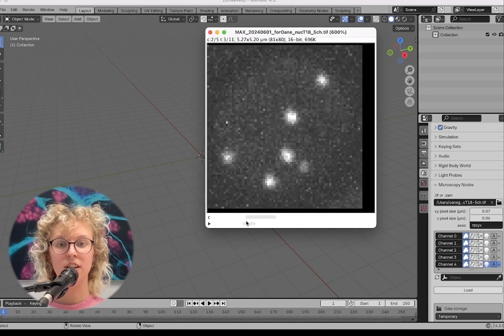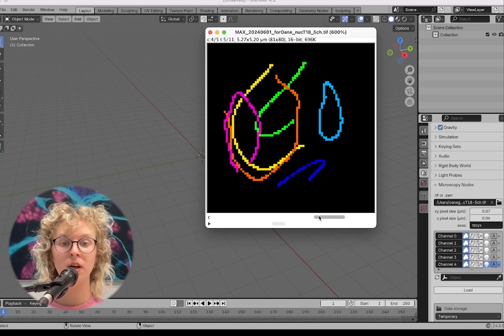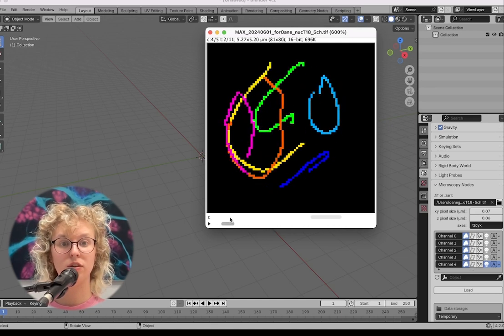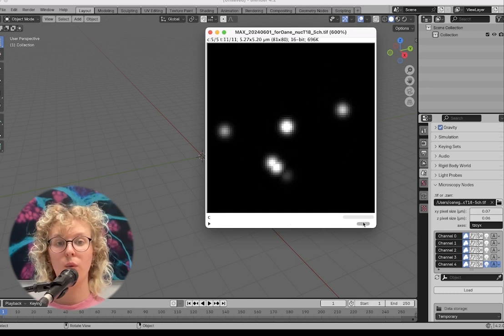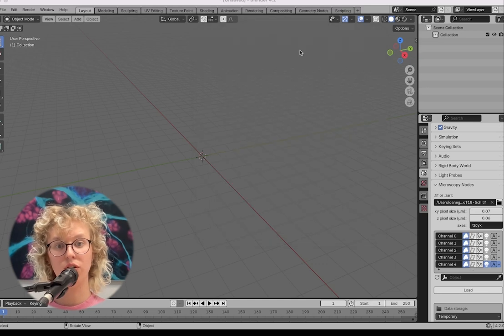And then in the second channel, we have the spots where the crossovers are. Then in the third channel, we get the localized spots of the crossovers per chromosome. This is analyzed with SpotMax. Then we have the chromosomes, so the separate traces of the synaptonemal complex signal made with big trace. And we have the size, the analyzed size of all the spots.